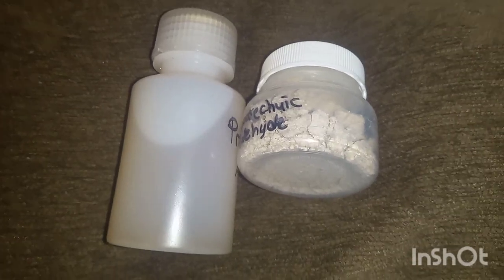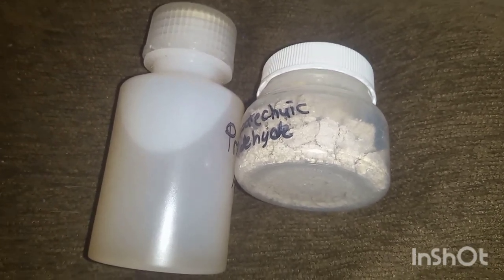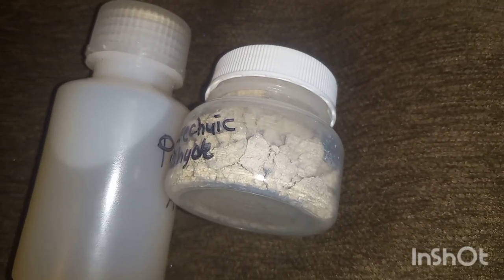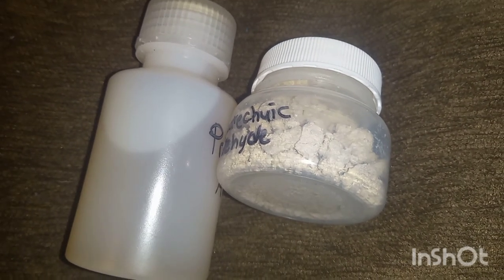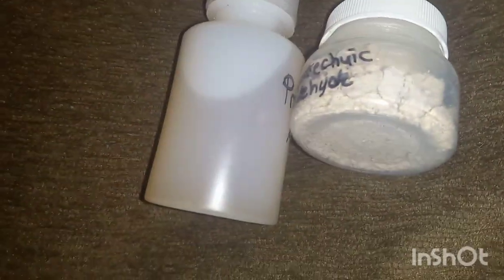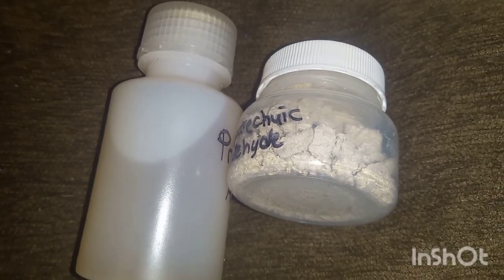Here we go guys — the final result: protocatechuic aldehyde. This is the final product. I'm going to have to dry it out a little bit and get a weight, because right now it is 150% of what it started, so I'm going to assume that's a false reading — it's still got water in it. This is the mother liquor and we'll see how this comes up.